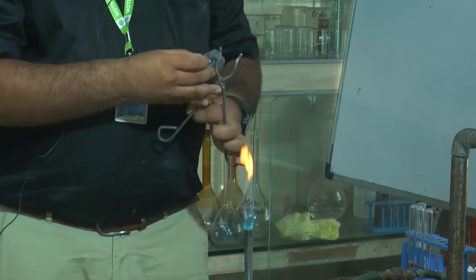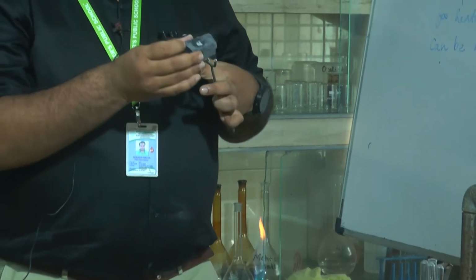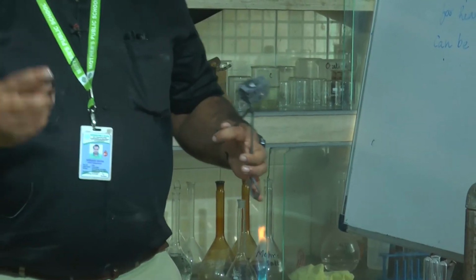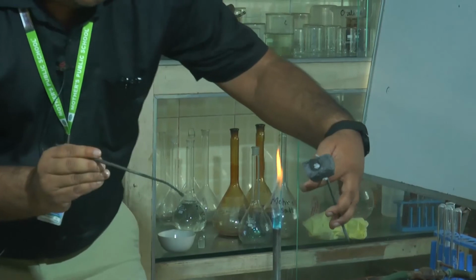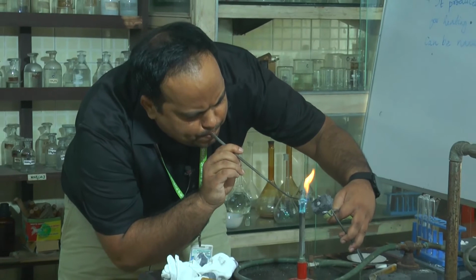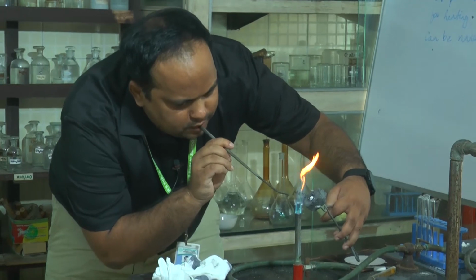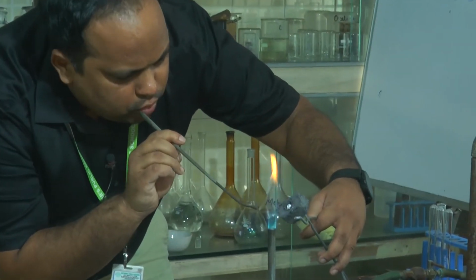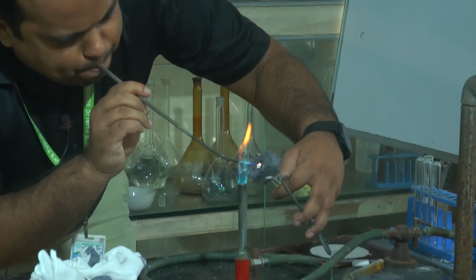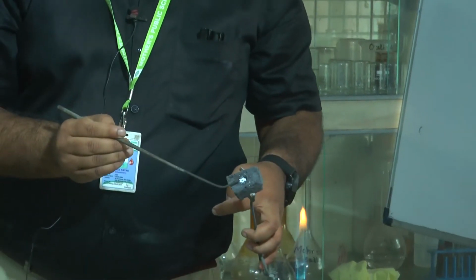Okay, listen. So this is your charcoal block. It has a hole. In that hole, I am taking the salt. You have to pick it like this. Then this is your blowpipe. You have to blow the flame onto this salt. You can see that the salt is glowing, becoming white, dark white. You can see the color becoming dark white.